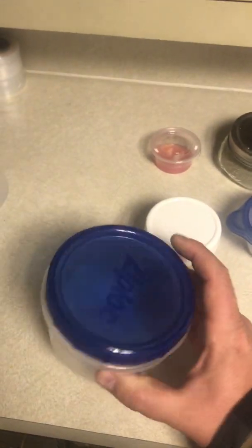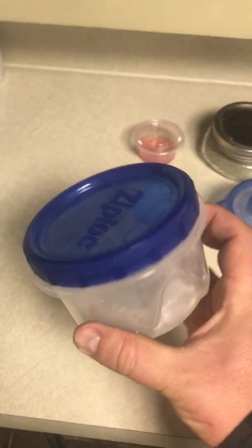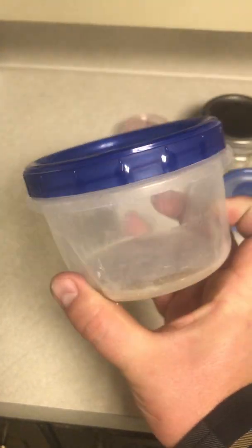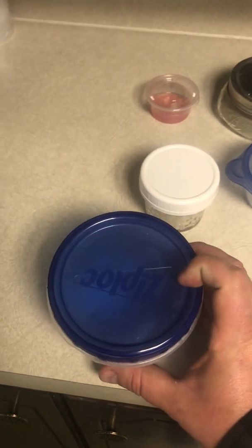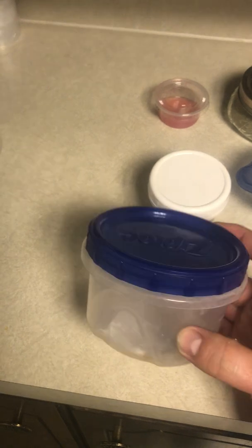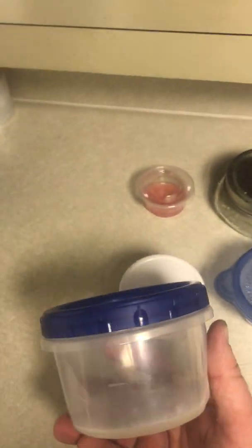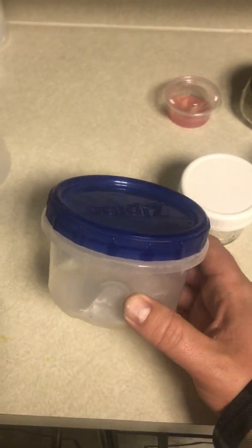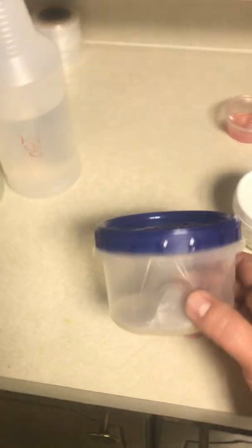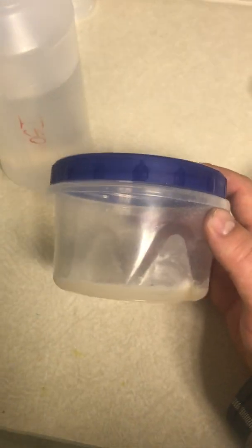These big ziplock containers — the reason I don't like them is simply due to the size. This is an old one with agar and some old mycelium in it. The bigger the container the harder they are to store, but the pro is they hold up really well inside a pressure cooker. If you're doing a no-pour where you pour your agar in the container and then pressure cook it, you can stack two or three in a small pressure cooker, whereas with the smaller glass ones you can stack a lot more and get more agar work done per cook.